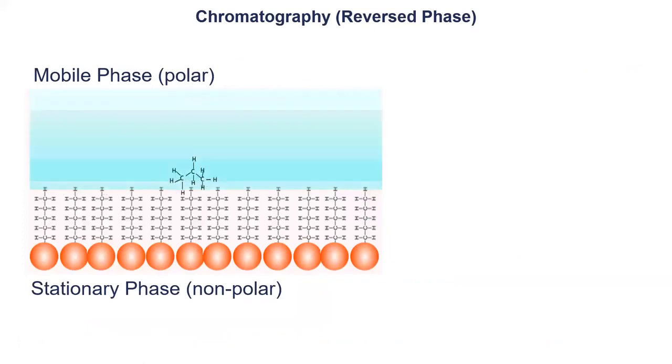And normally, for most applications, I would say, we use reverse phase chromatography, and then we have our stationary phase with normally C18 length. And then we see that we have one compound here, the lower compound, which has more affinity to the stationary phase, so it's slower eluting from the column. And then we have the second compound, which has a hydroxy group, so it's more polar and has less interaction with the stationary phase, but more with the mobile phase. And then it's eluting faster than this one. We see the other one is already gone, and the lower one is still interacting and reaches the end of the column at a later time point.